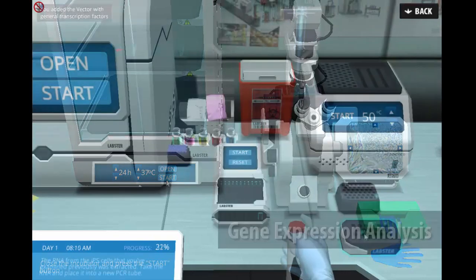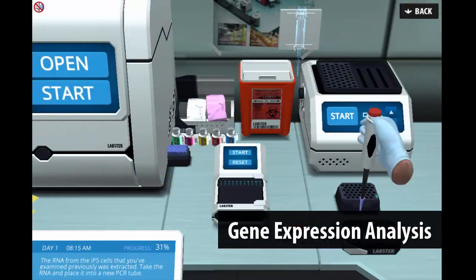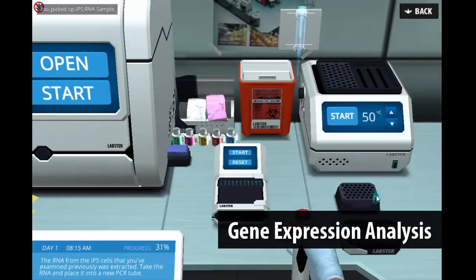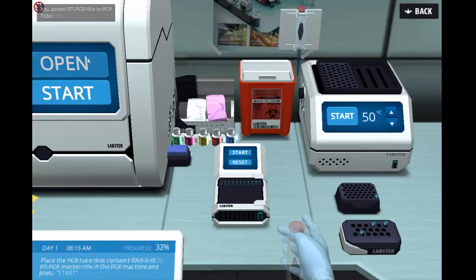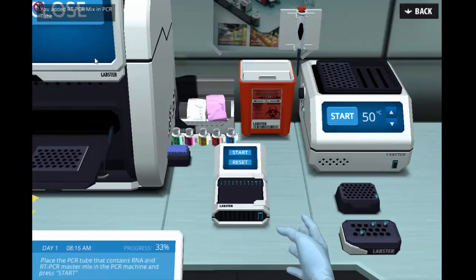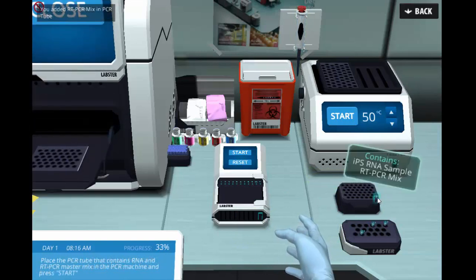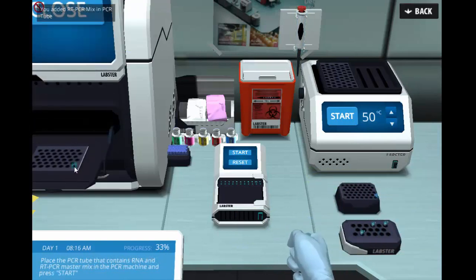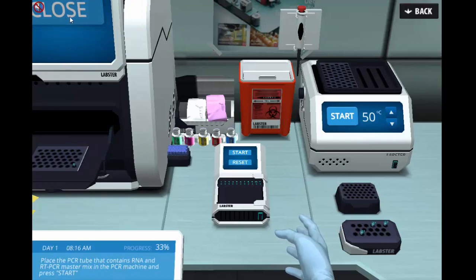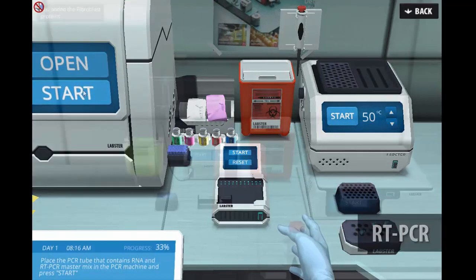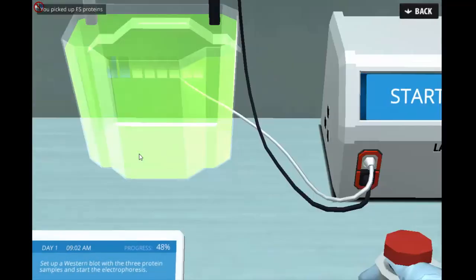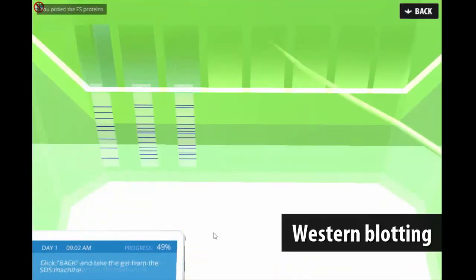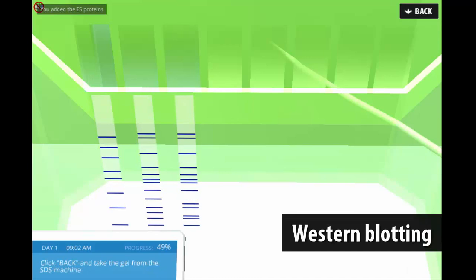After the transformation, students need to confirm that their selected genes are upregulated in fibroblasts. Students check their mRNA transcripts by using RT-PCR and also protein levels using Western blot.